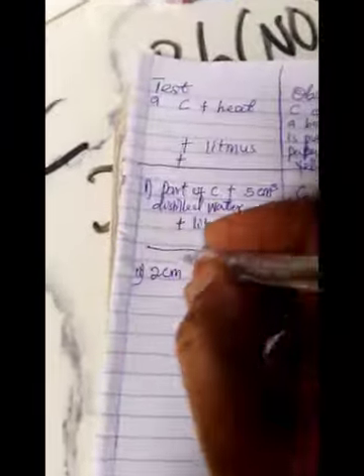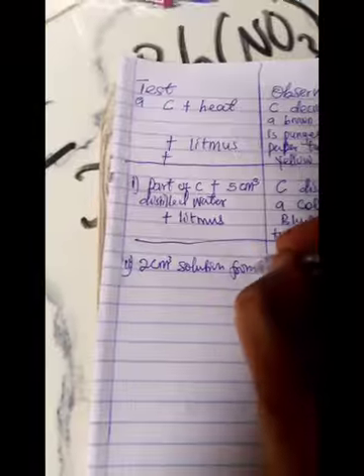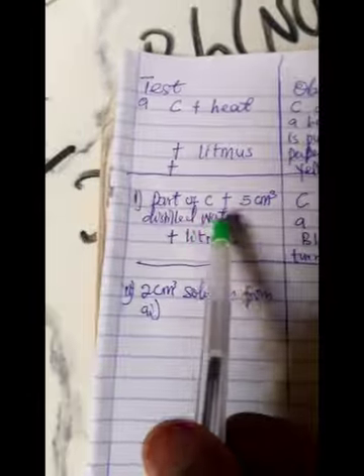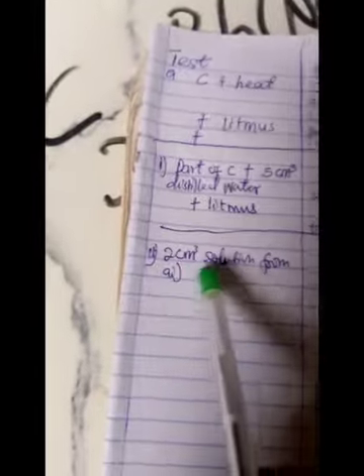All right, so that solves this part. Let's now go to AII. So take 2cm cube of solution from AI. The solution we just dissolved here is acidic. So we collected 2cm from it.